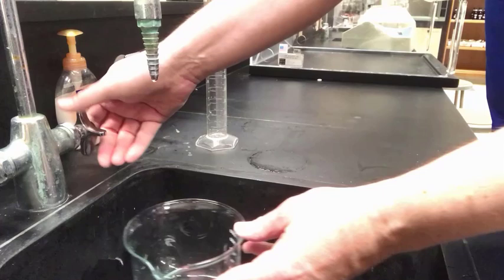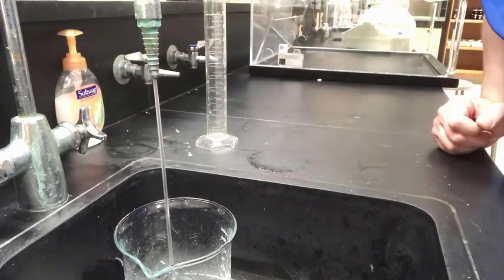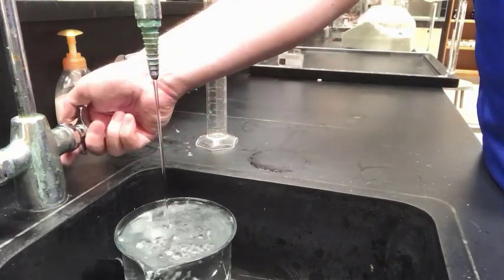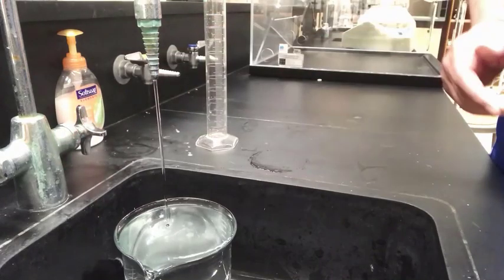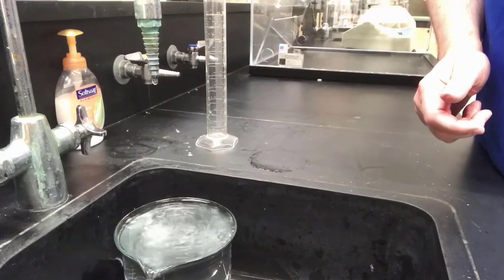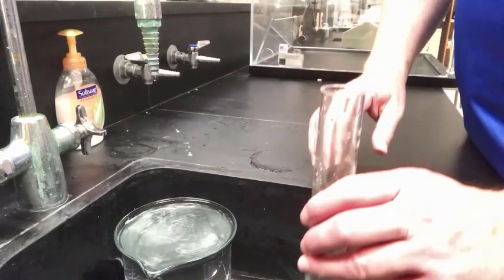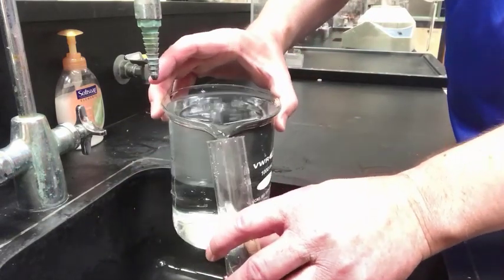So let's look at the calculation of the density of the soda cans. At the sink, you can take one of the litre beakers and fill it up to the brim with water. Remember, the flat bottom beakers are inaccurate, so we need an accurate measurement of the water volume in one of these beakers. Fill it to the brim till it overflows, and then start decanting this liquid from the beaker into the graduated measuring cylinder. You need a steady hand. We don't want to lose any of the water that's in that beaker when it's to the brim.